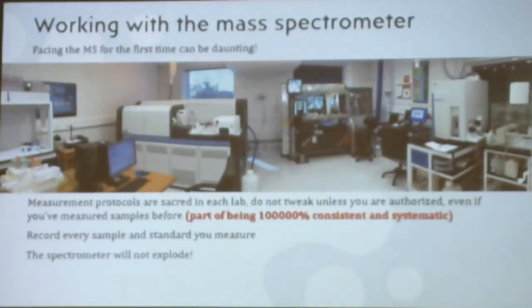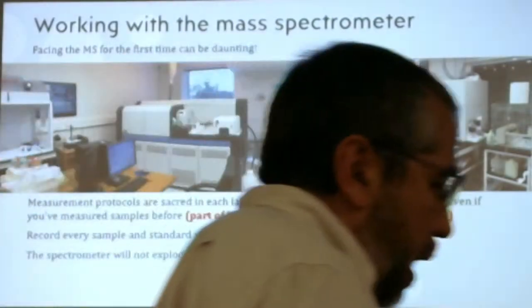And finally, working with the mass spectrometer. I don't know about you, but for me, the first time working with the Neptune mass spectrometer was daunting. It was just like, this is huge. The instrument will not bite. The instrument will not explode. But stick to the protocols that are specific to each lab. You might have experience working in Larry Edwards' lab. The protocols will be different if you're working with Hai Cheng, and different if you work in my lab, and different if you're working in Germany. Why? Because each instrument has slight differences, and you better stick to those protocols. There's a long work behind developing those protocols. And yeah, thank you very much.